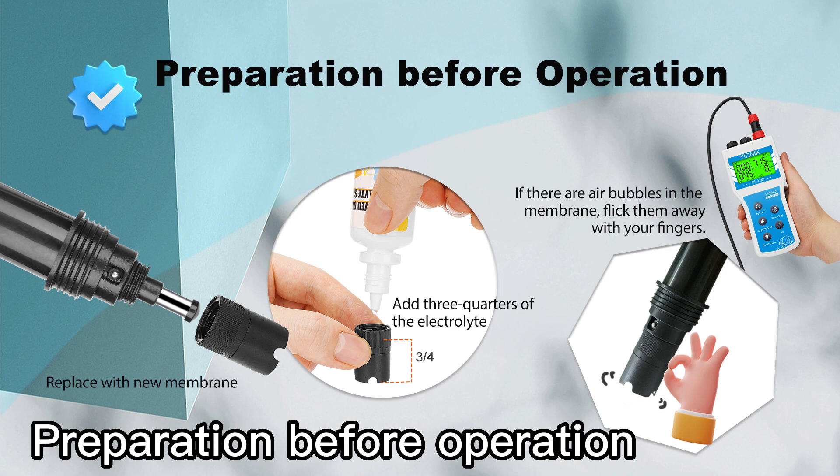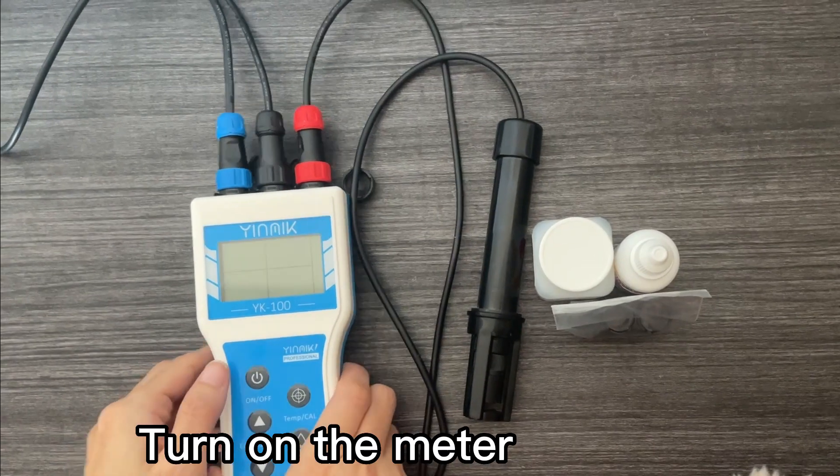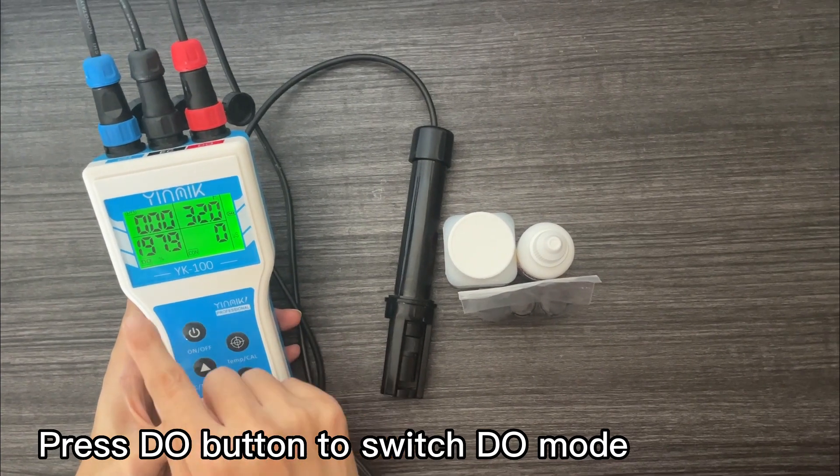Preparation before operation. Turn on the meter. Press the DO button to switch to DO mode.